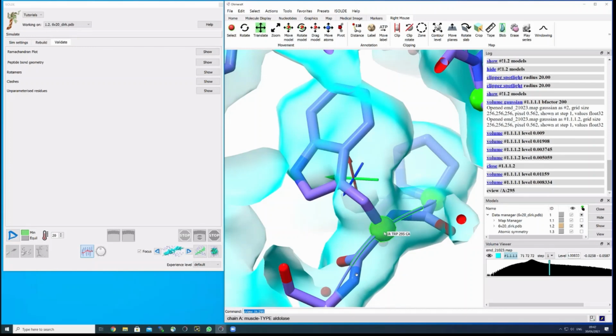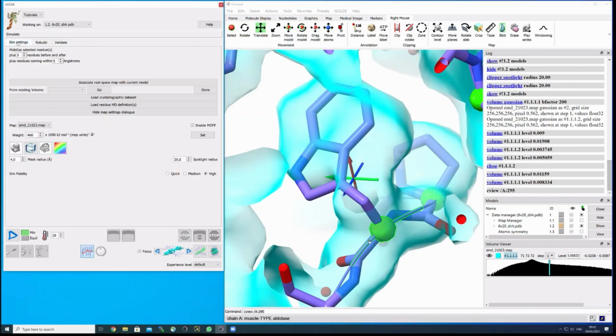This selection is now being used to inform Isolde what should be simulated in the structure. You can simulate the entire molecule at once, or you can do a simulation locally. I always recommend to do it locally. And if you have a weak computer, simulation of the entire molecule will anyway not really be feasible. So I now select the C alpha of this tryptophan, and to fix this, we can start a simulation first. For this, we go into the simulation tab on the very left.